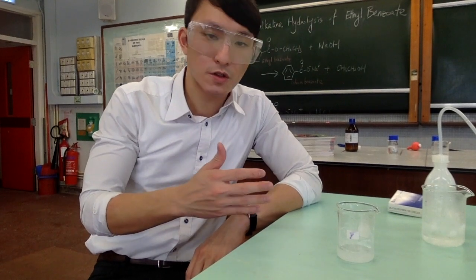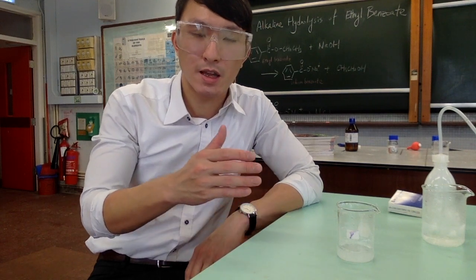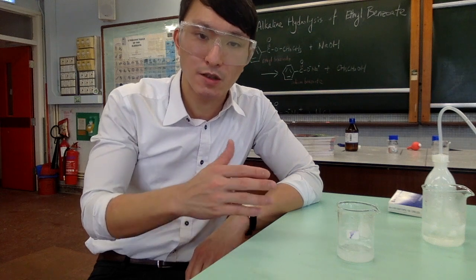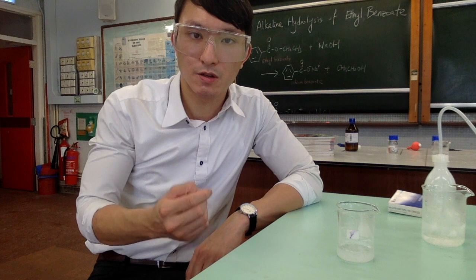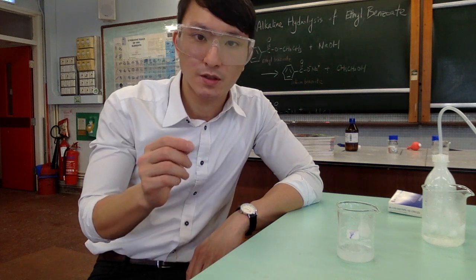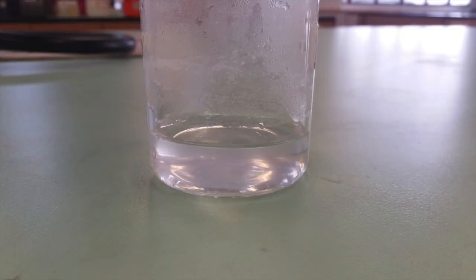After dissolving all the solid in hot water, we will let it sit at room temperature for 5 minutes. During this period, as the temperature of the water goes down, the benzoic acid crystals start to form, and you should be able to observe needle-shaped crystals of benzoic acid.